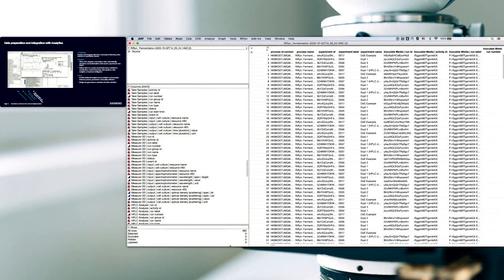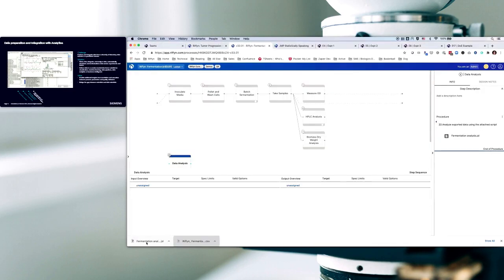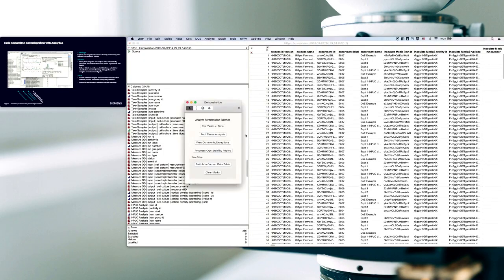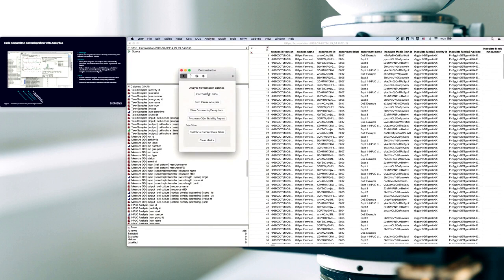for data analytics. So we have a way to clean the data, simplify, reduce dimension, for instance, or highlight the relevant parameters which were used during the process, identify the ones that are already correlated, and then we can build more advanced features.